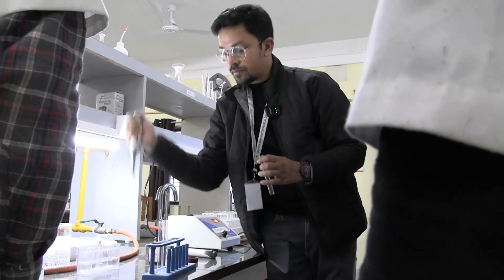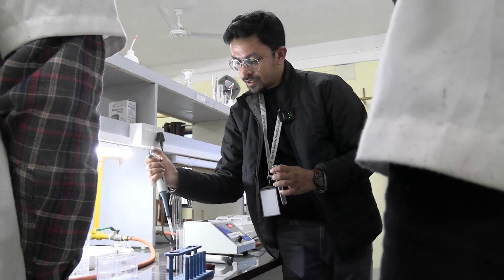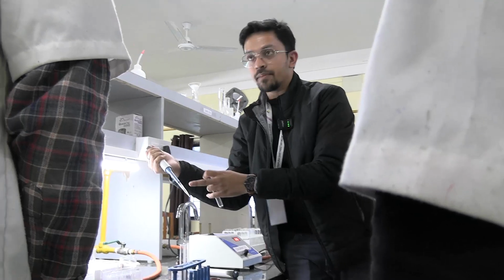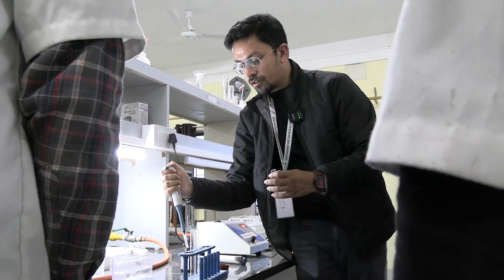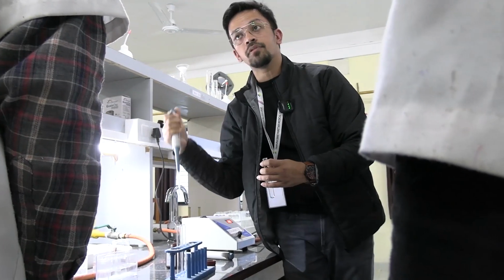Pressure is created. Put it in. Take the sample. See, over there some air came, so I have to discard it. I cannot take this. There should not be any air. If you see there is already air in your sample, you cannot take it.